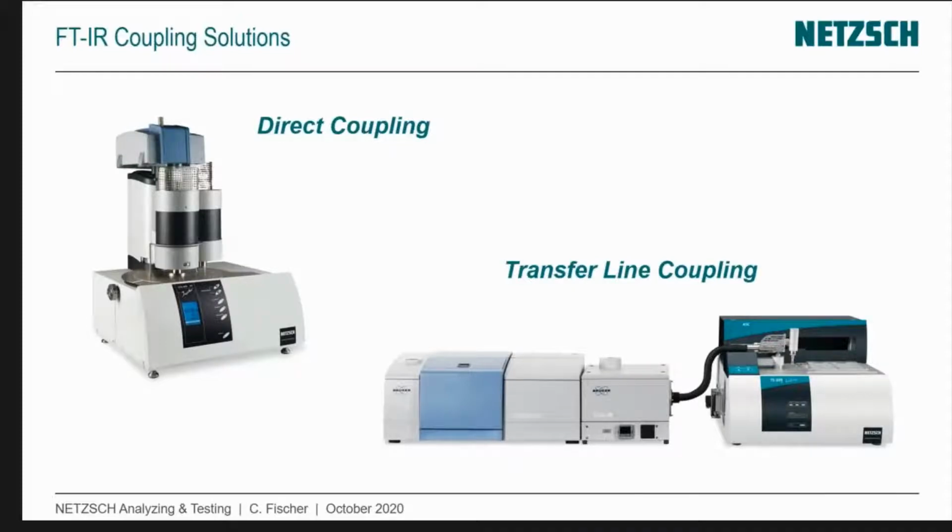On the left, the direct coupling, the so-called Perseus coupling. This is the case when the Bruker Alpha spectrometer sits directly on top of the gas outlet of the furnace and is connected by a short and heated steel tubing. This is a very space-saving and cost-effective version.